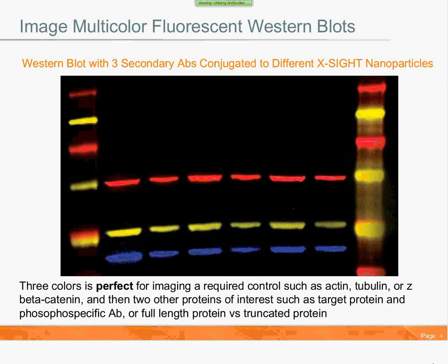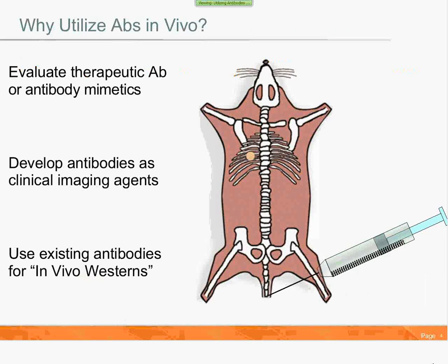These are normalizers that have to be present in really any Western blot to show normal loading or to normalize for loading of the different bands. The nice thing about conducting these experiments all in one, of course, is that you don't have to worry about stripping and reprobing and how that may affect your ability to detect bands after each strip and reprobe in the process.